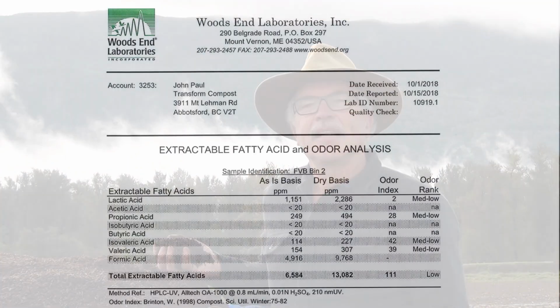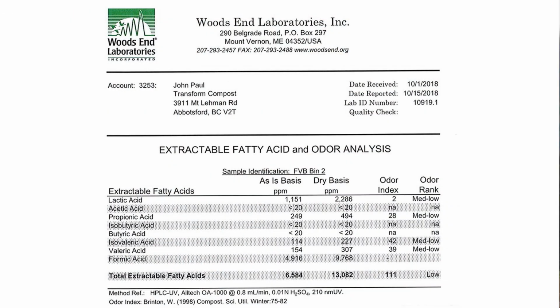This simple test is most commonly used when the active composting process is complete or after curing, when the material is ready for screening and marketing. If we test for organic acids after active composting and before curing, remember that organic acids can accumulate during curing if the piles are too high and the microbes don't have enough oxygen. Let's look at what this test provides.